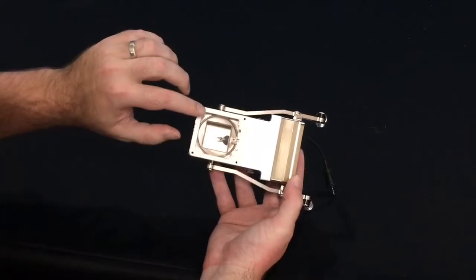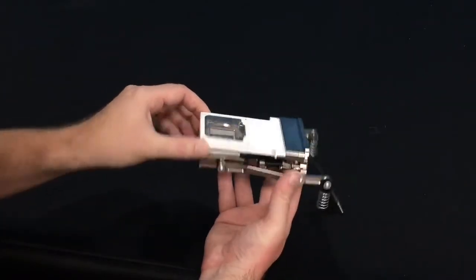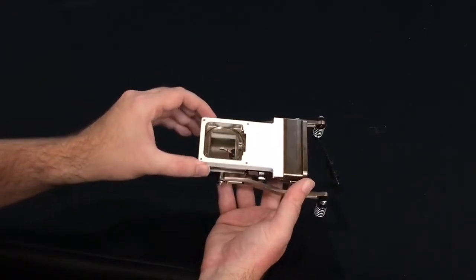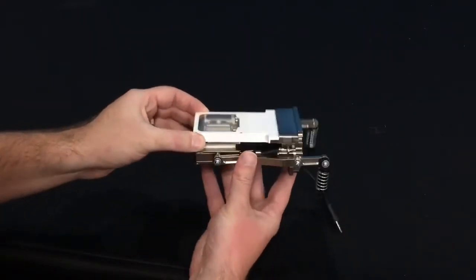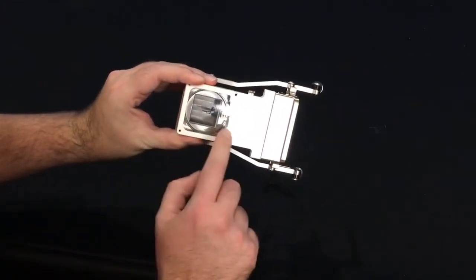This chamber has a clear top by default, a propafilm cover, but you can also add a red-blue light source on top of that, which I'll show you later in this video. As you can see, this chamber right now has a 3 centimeter by 3 centimeter aperture.